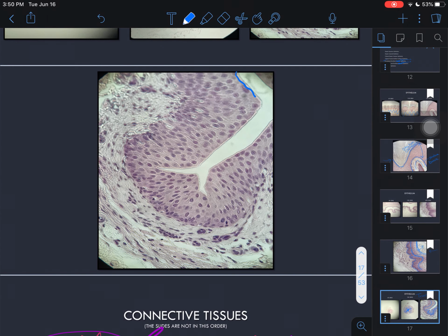Again, you'll see here one arm of that snowflake or lumen, and as he fills with urine, he's going to push out and fill, and it's going to change the shape.